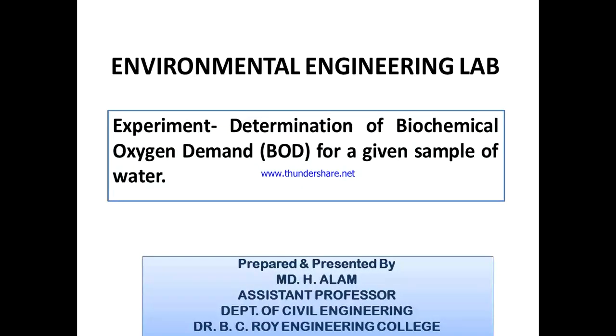Good morning, students. Today we'll be doing the experiment determination of biochemical oxygen demand, BOD, for a given sample of water. So we'll be determining the total quantity of BOD in a given sample of water or wastewater, whatever is the case.